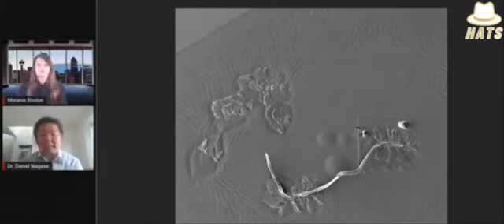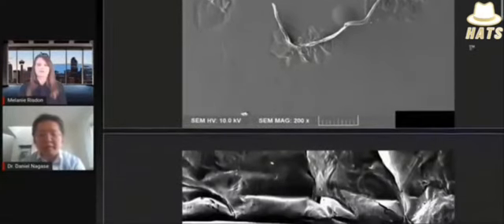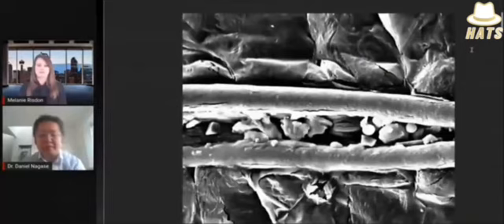So this next one, this is the most zoomed out photo. This particular structure was, I think, big enough to see on an optical microscope, although I don't have any optical microscope pictures for this particular presentation. But if we scroll down, we'll zoom in on it and get a closer look at what we're looking at. So we see a strand on top of some crystals.